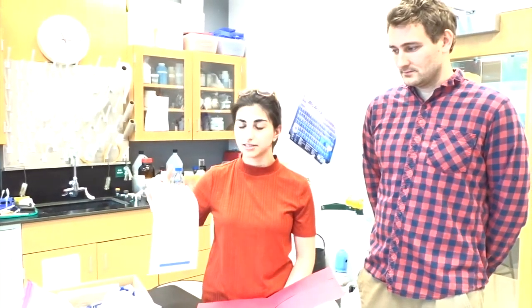We hope you enjoy. So in this kit, you'll receive a folder of materials that'll help you guide the activity. This folder includes a materials checklist for all of the activities that you should use to make sure you've gotten all the materials, and then you can also return them after you're done using the kit. There's also a teacher handout that you can use to help guide your lesson, and it provides you some more information on the chemistry behind the kit.